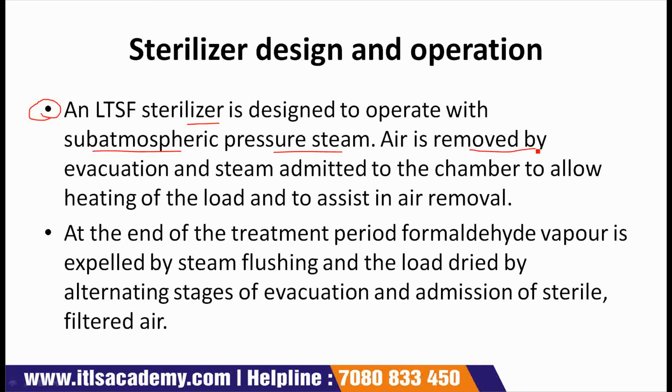Air is removed by evacuation and steam admitted to the chamber to allow heating of the load and to assist in air removal. The chamber temperature is maintained by a thermostatically controlled water jacket, and steam and condensate are removed via a drain channel and evacuated condensers.